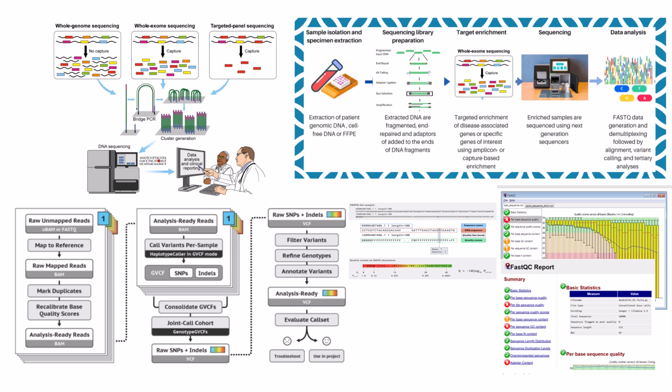It really does. And after that massive automated annotation, there's often one more step. Custom filtering. This might be a separate script, maybe in Python, that applies lab-specific or case-specific filters. Tailored to the patient. Yeah. For example, it might prioritize looking only at very rare variants predicted to be damaging that fall within a list of genes known to be associated with the patient's specific symptoms or family history. This helps focus the final review on the most likely candidates. So annotation adds the meaning, and custom filtering sharpens the focus right at the end.